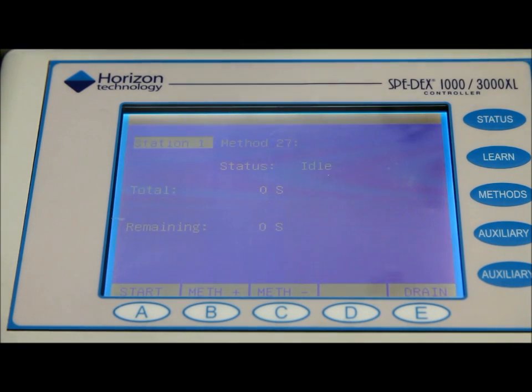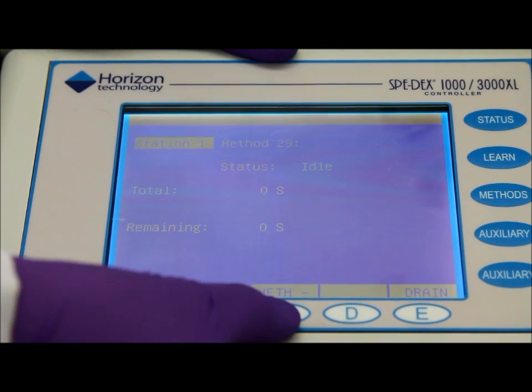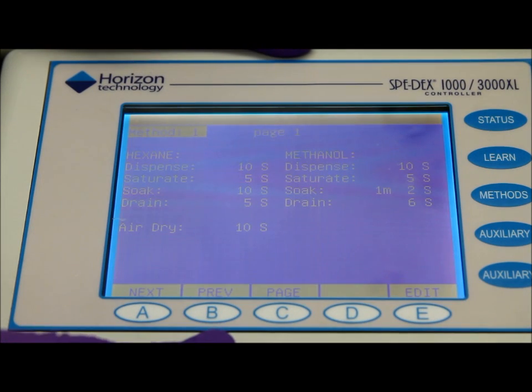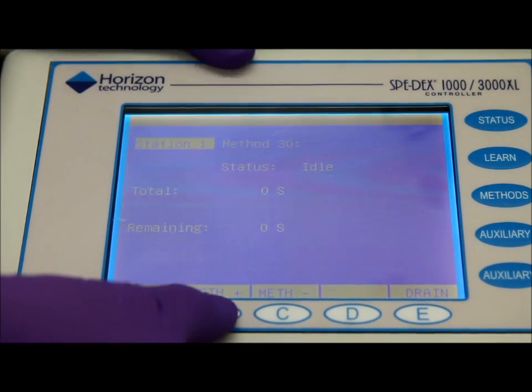You can easily go into this controller and find the method that you want to use. There are pre-programmed methods as well as customizable methods that you could use. And you can easily choose your method, press start and hit yes and it will begin your process.